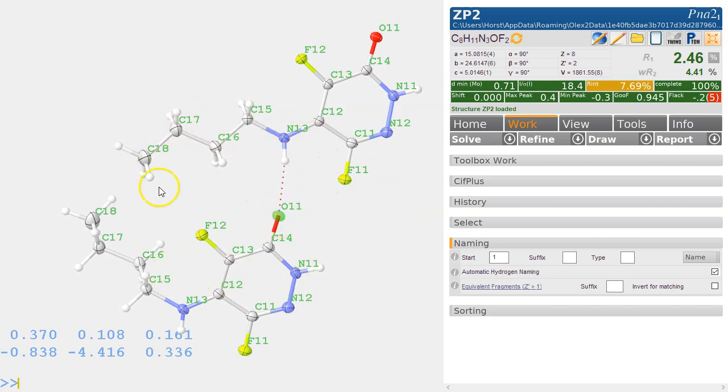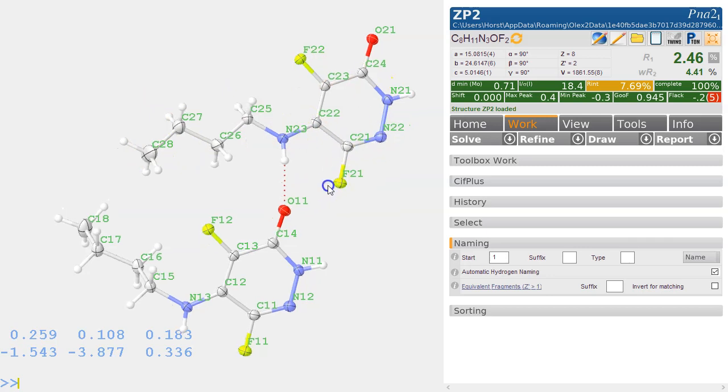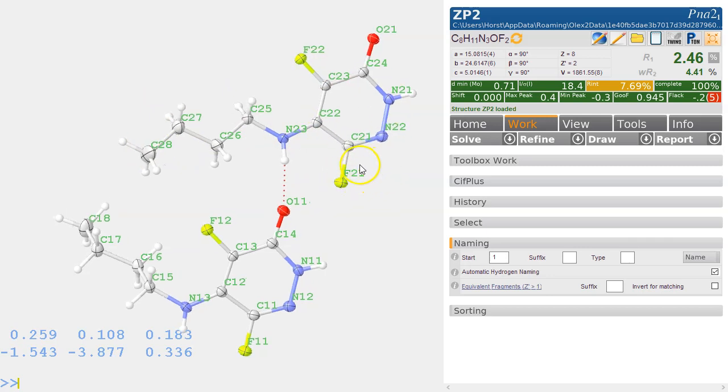We take this as the base, so we're starting the naming from here and transfer it over to here. Now go back to mode match -n, but now we use a dollar sign. That means the first character after the element symbol is replaced. If you now make this two, then the one here will be replaced and it will be two. So we're now back to the naming scheme that we had initially.